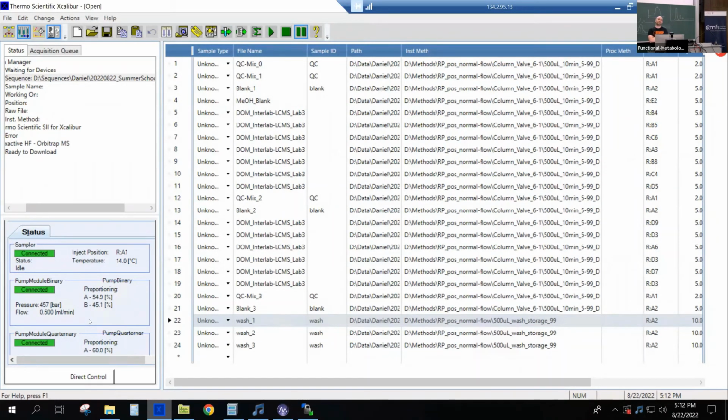The apex trigger, the time you set, you just look at peaks first, how... Second question was, I see you used different injection volumes for the QC.